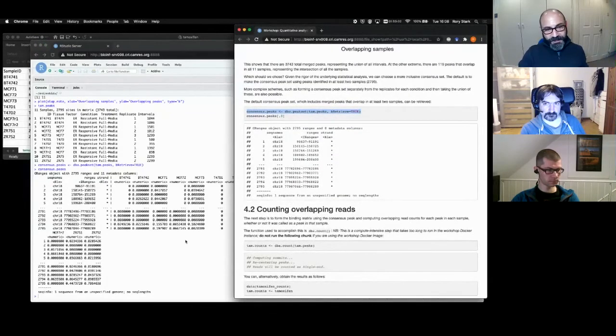So at this point, we're going to use the default consensus peak set and counting reads.